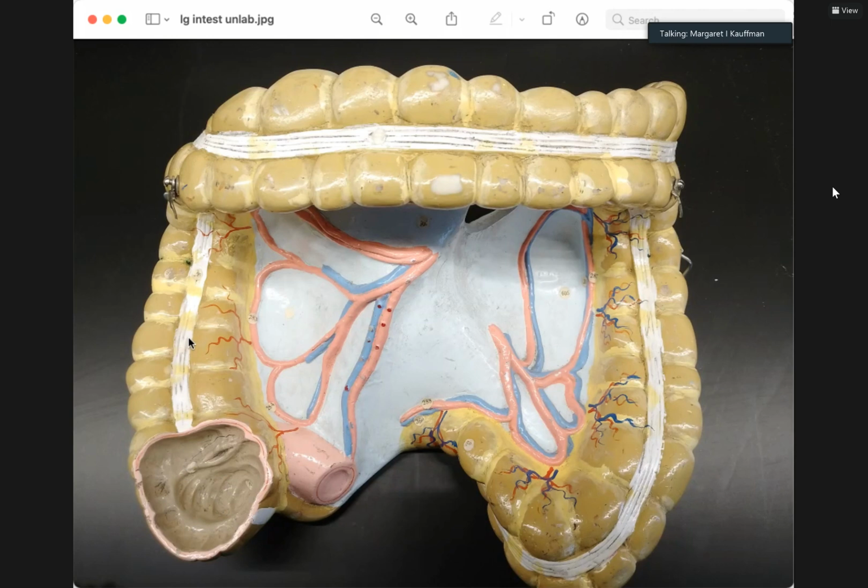Okay, so this is a typical mucosal membrane, but the longitudinal layer is thicker here, thinned on each side of it, which helps form these pockets called haustra, or house in German. And this thing that makes it is called the taenia coli. It's just an elaboration of the longitudinal muscle layer, the muscularis externa, and probably the fascia, the way the connective tissues are arranged. So you get these kind of bumps called haustra.